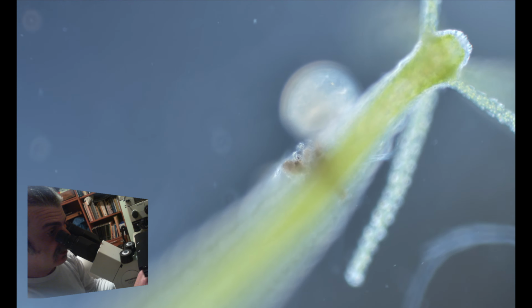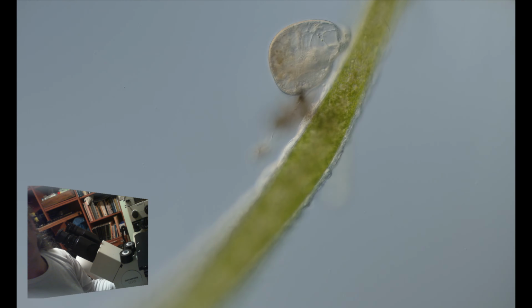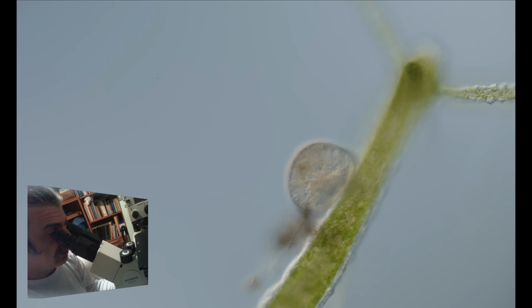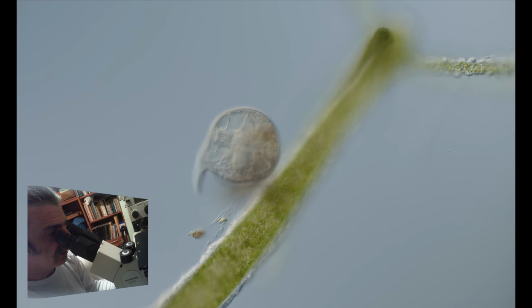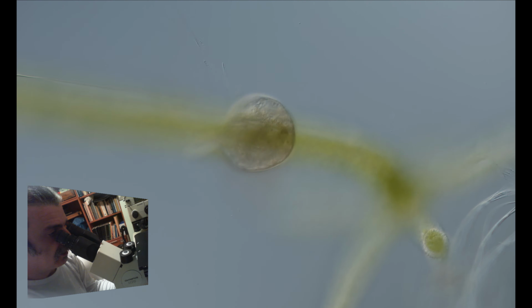which will give us more detail and resolution, and we can see, yeah, that's a Trachelius. It's a ciliate. A very large one, like a floating balloon, and you can see it has a head that protrudes. Here you can see it. It's a predator ciliate, and often you can see it engulfing large prey.